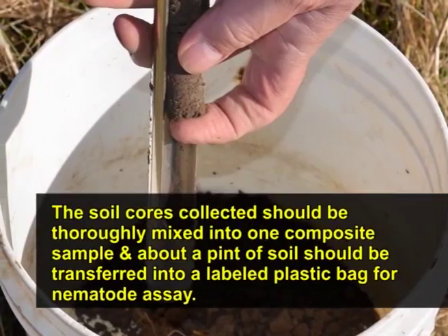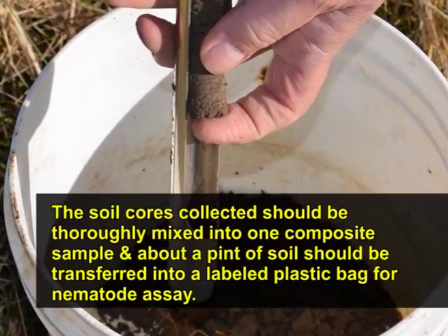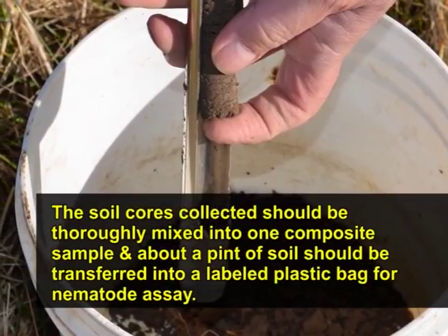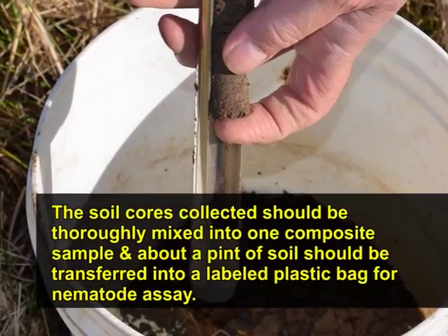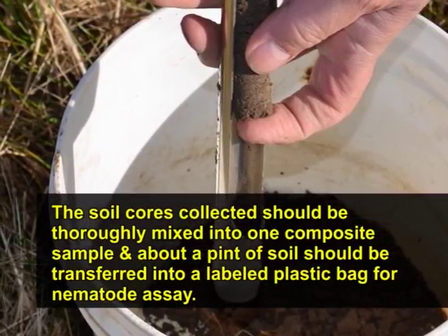The soil cores collected should be thoroughly mixed into one composite sample, and about a pint of soil should be transferred into a labeled plastic bag for nematode assay.